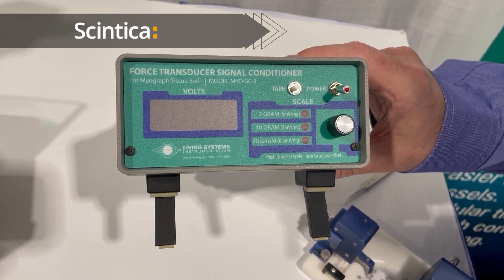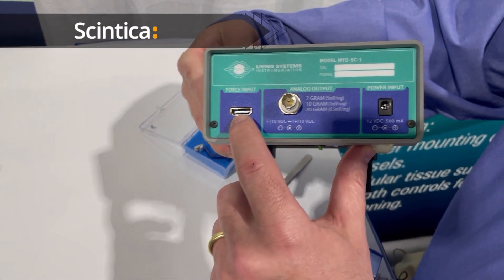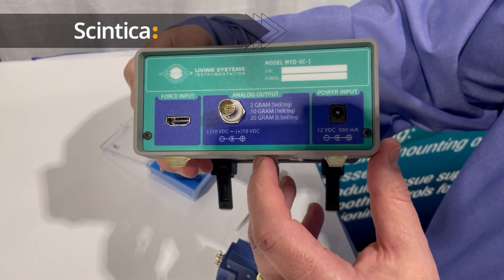On the back of the instrument is the connection to the force transducer and your analog voltage output that can be connected to any standard lab data acquisition system.